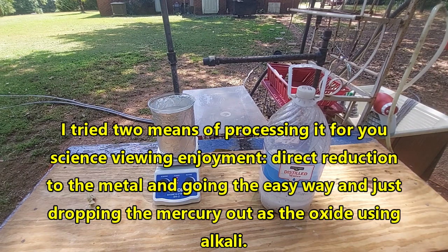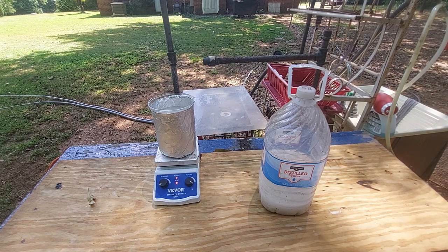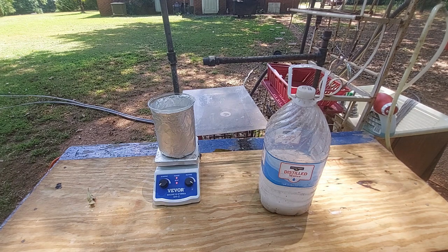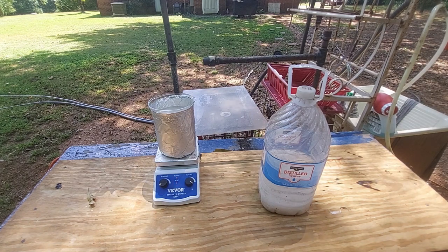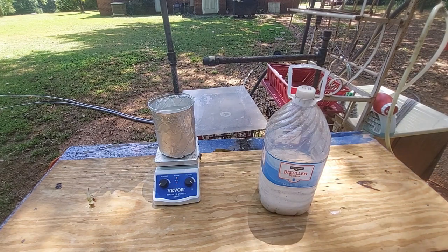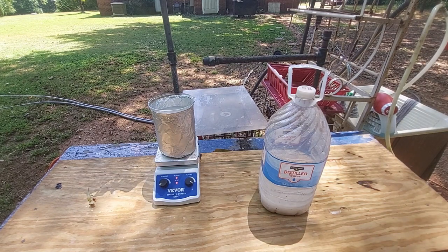The first step is to evaporate it down to a more manageable volume. Then we'll start by trying to oxidize everything in there — if it's a mercurous salt we should be able to oxidize it to the mercuric salt, which should go into solution. I'm thinking HCl with a nitrate, HCl with nitric acid, or just bubbling chlorine gas through it for hours. All of these are viable routes — you'll see in the next clip which way I decided to go.